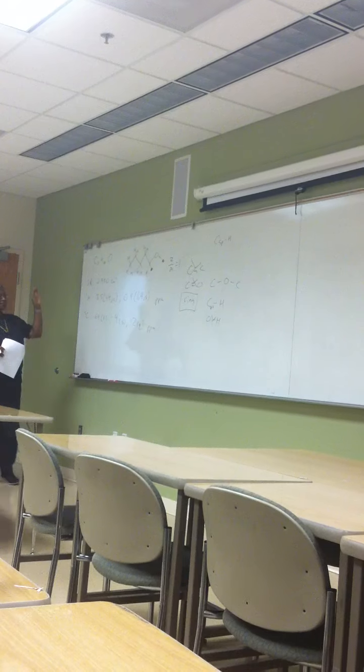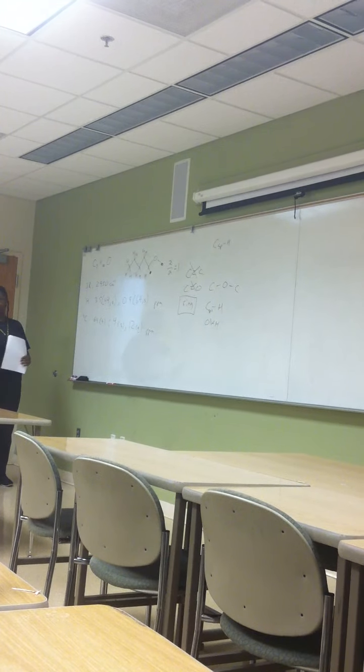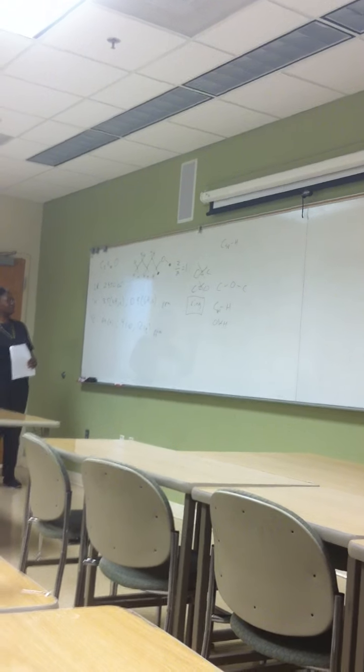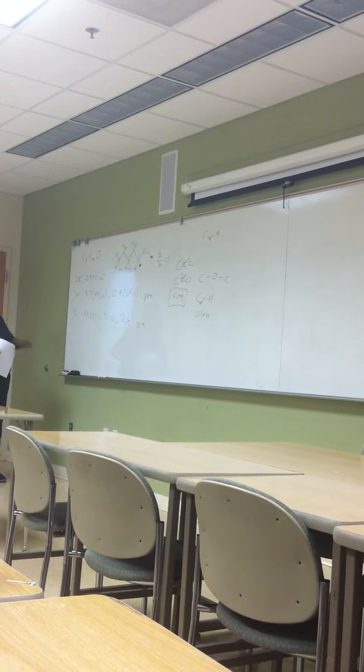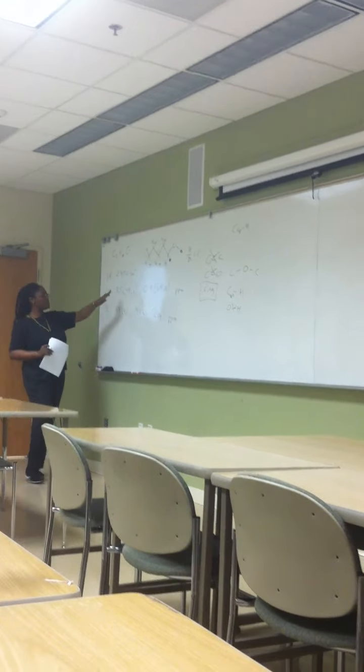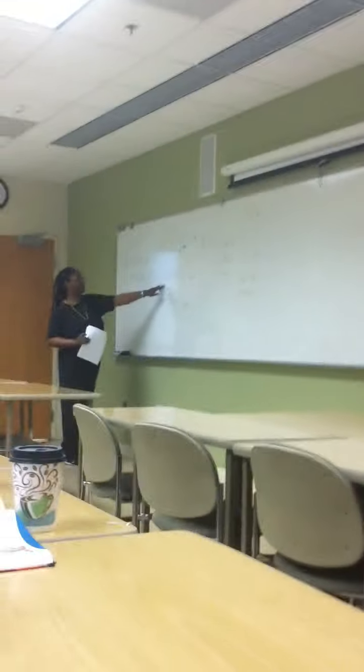And so you get that just from IR, okay? Now if I had given you the full spectrum, then you could see if there was any CO stuff going on in the CO region, okay? So now we can look at the proton spectrum. We only have two different types of hydrogen, okay?